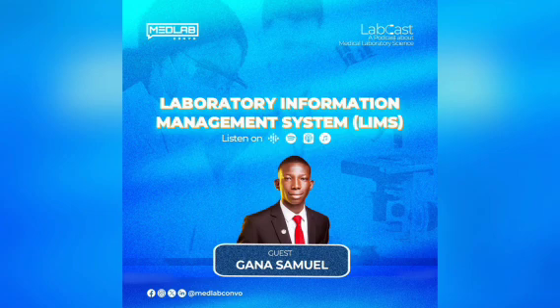So I believe that these foundational things are what every lab should prioritize: sample handling and the automation interface where machines communicate. These are the things that I believe that with LIMS, a basic lab can start with. Thank you. All right. Thank you so much, sir, for that insightful reply.